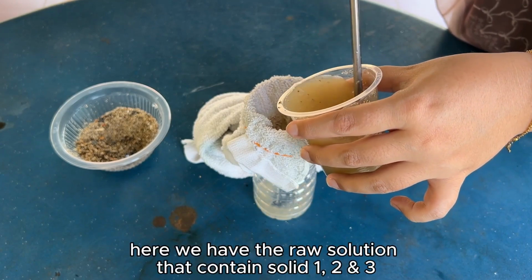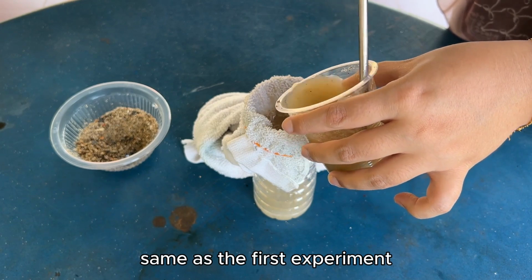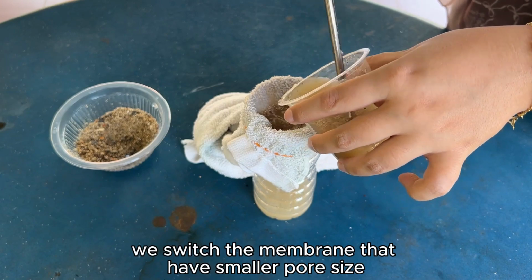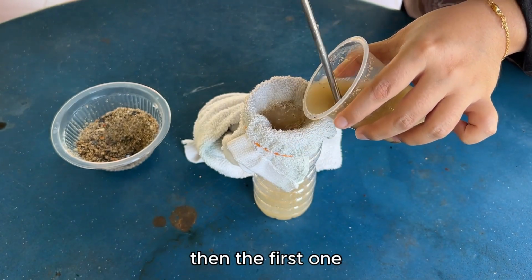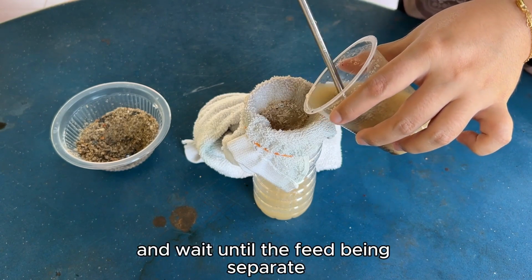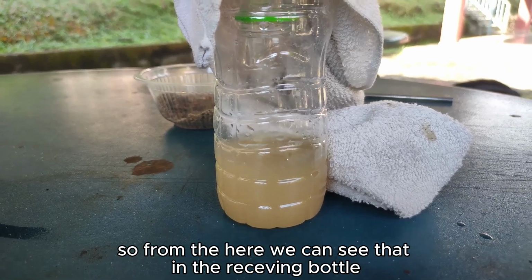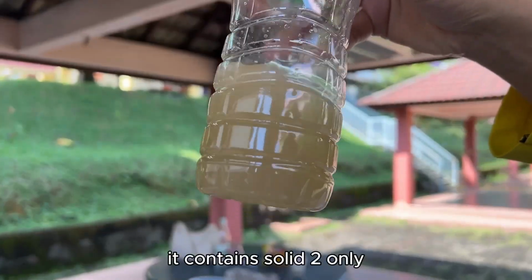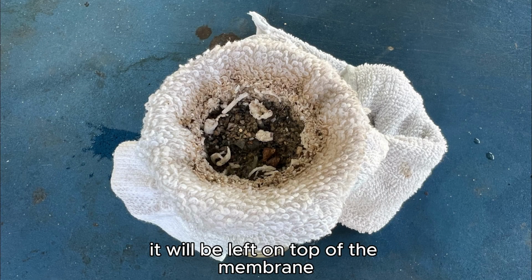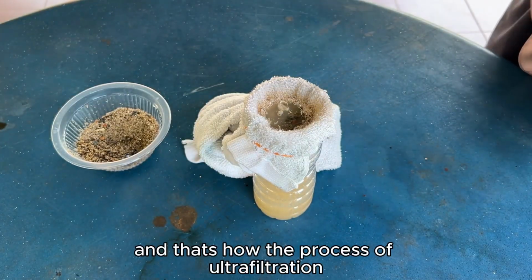Here, we have the raw solution that contains solid 1, 2 and 3, same as the first experiment. Then we stir it. And this time, we switch to a membrane that has a smaller pore size than the first one. So we pour the feed on top of the membrane and wait until our feed is separated. So from here, we can see that the receiving bottle contains solid 2 only. Meanwhile, solid 1 and solid 3 will be left on top of the membrane. And that's how the process of ultrafiltration works.